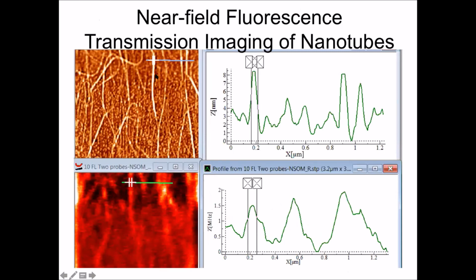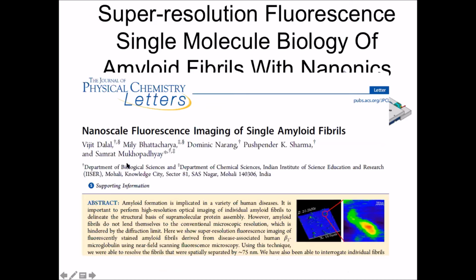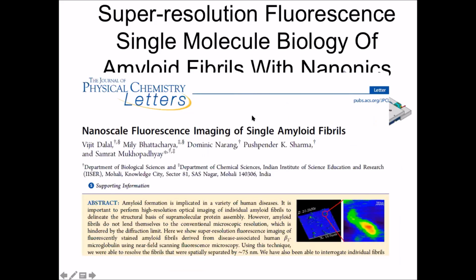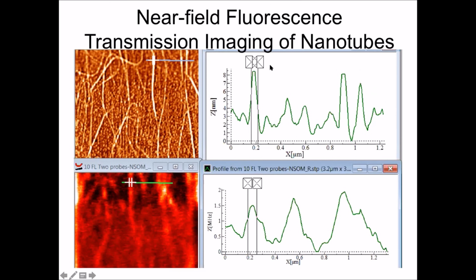These are organic nanorods, okay? And you can see here that this is the structure of it. That's this nanorod, okay? Do you see these three guys here? That's these things. You see this? That's this, okay? Do you see this wavy area? That's this wavy area. So you can correlate exactly the fluorescence. The fluorescence is a little worse, quite a bit worse than the AFM, okay? But still, well, it's 70 nanometers. Okay.